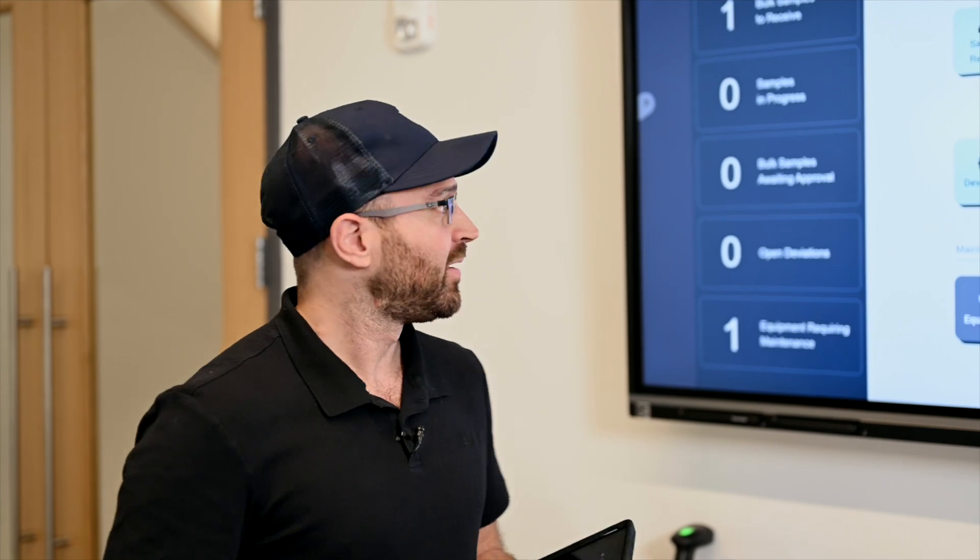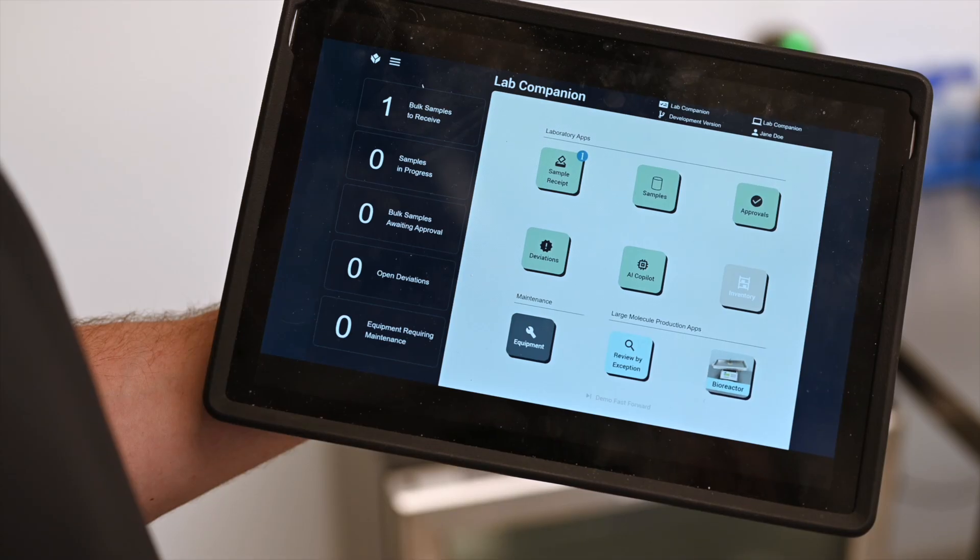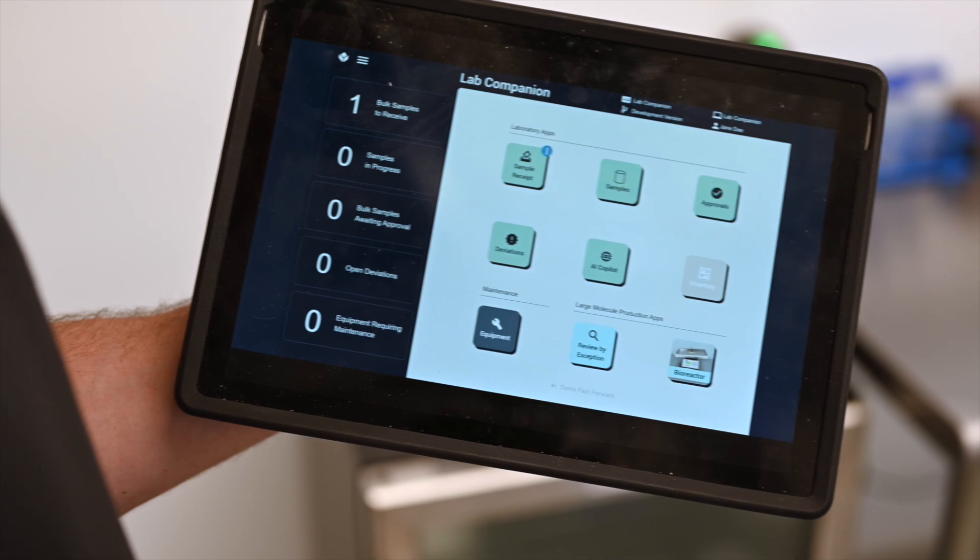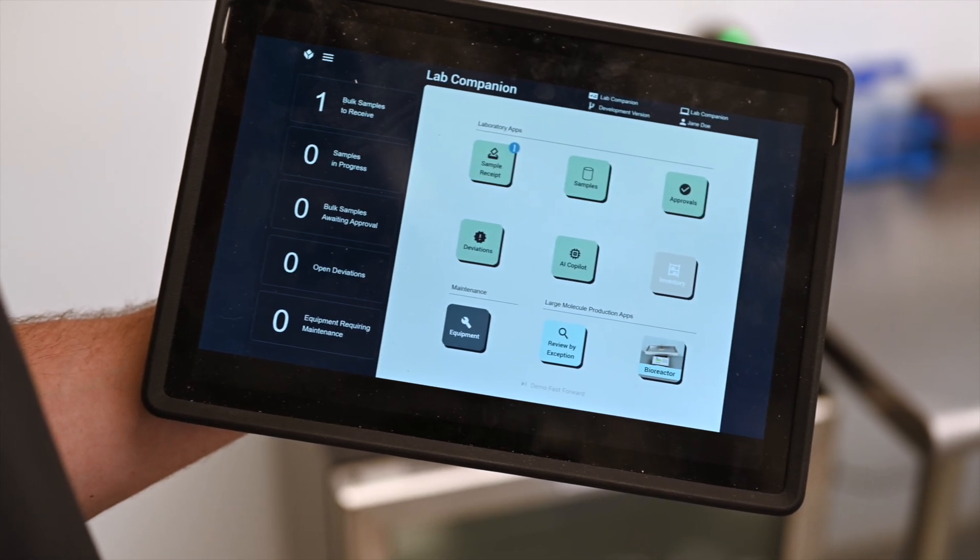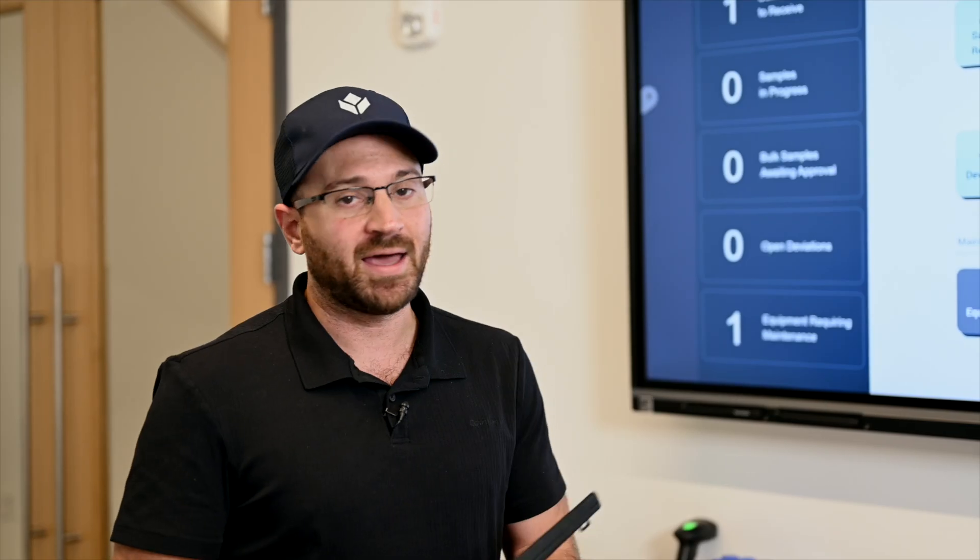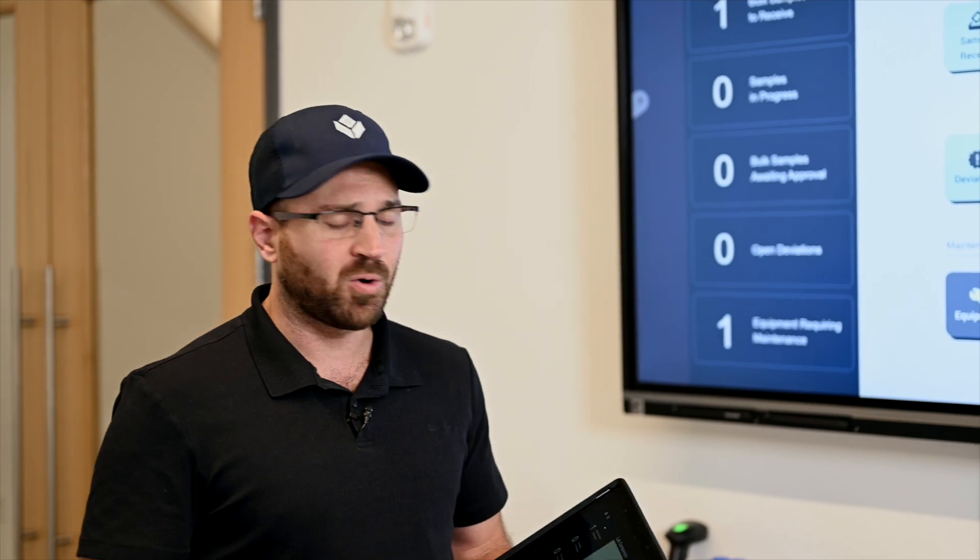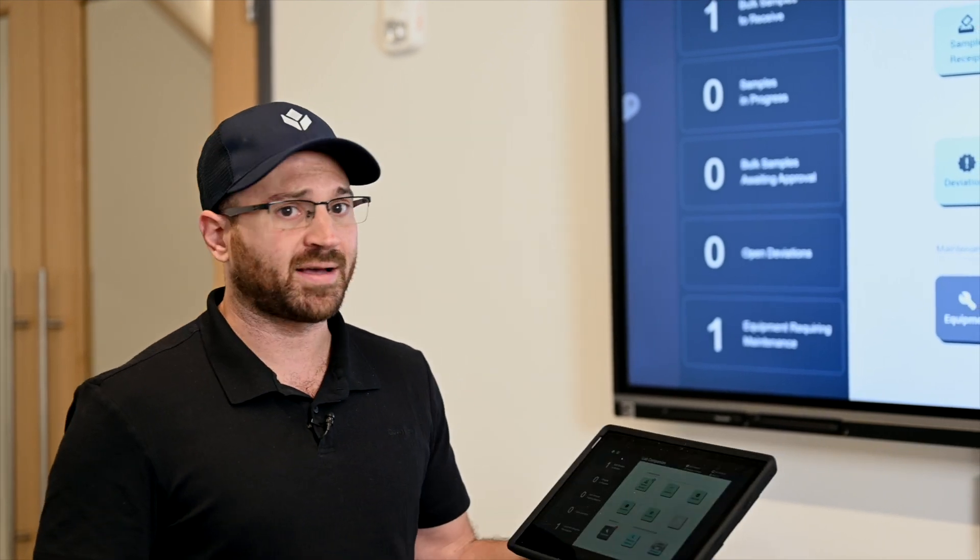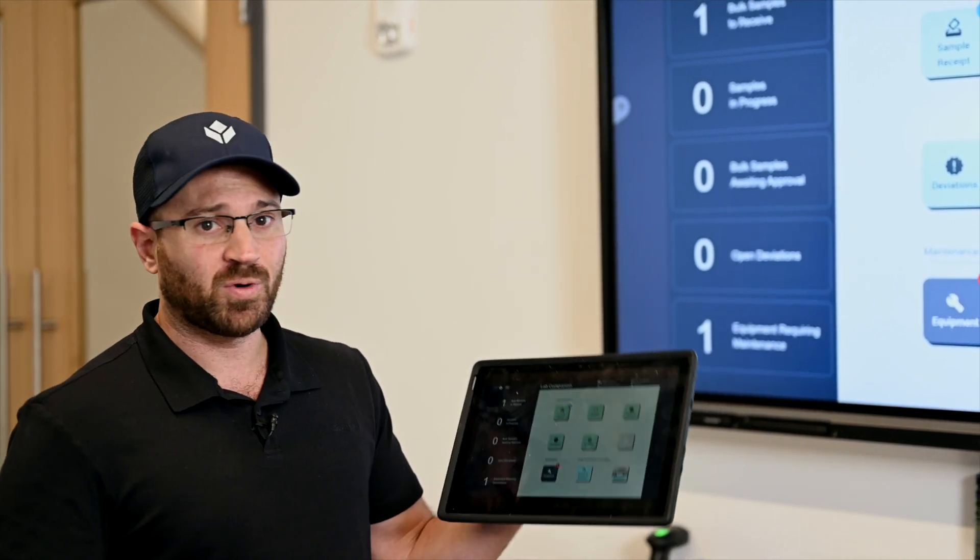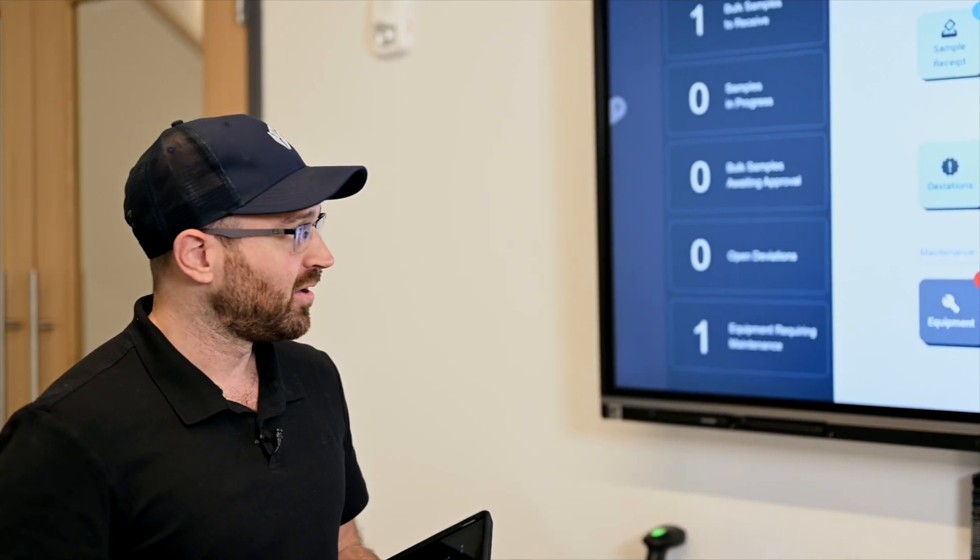We built this with a partner Sequence, and in this example we have a lab companion, which is a mobile device that different people throughout the lab can use. Analysts as well as lab managers are all going to be able to access different applications through this one mobile device.